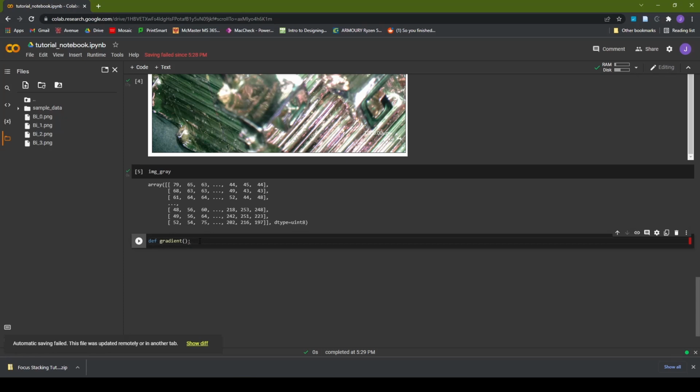Okay, so then when you're here, you can just press Enter, and Python will detect that you've written a function and kind of create a little tab for you at the bottom. This is a part of the syntax with a function, so you can't just start writing your function like this. You have to have that little indentation there to work with.